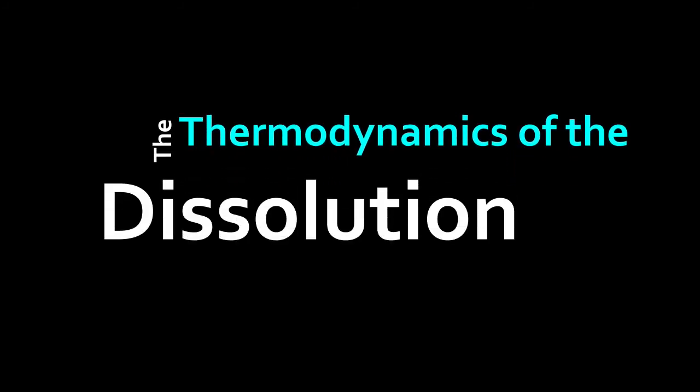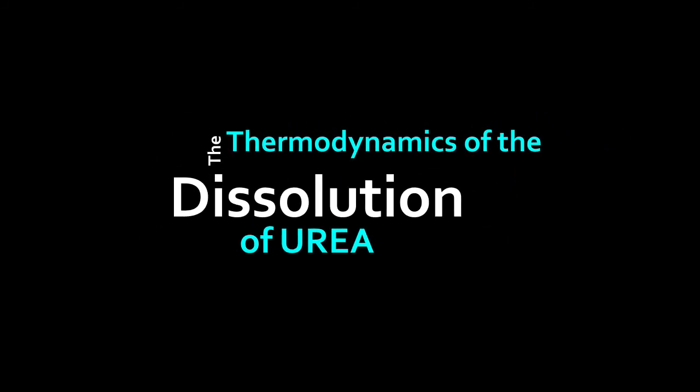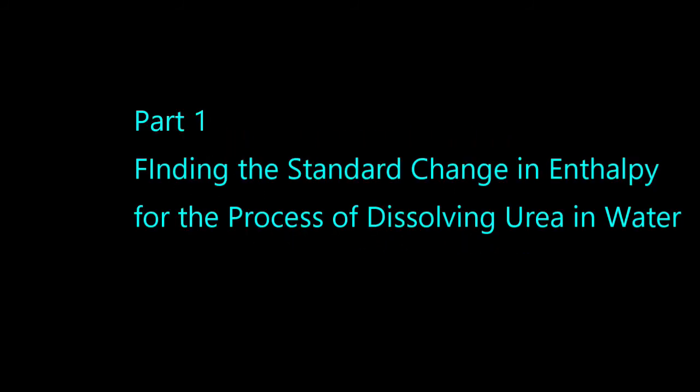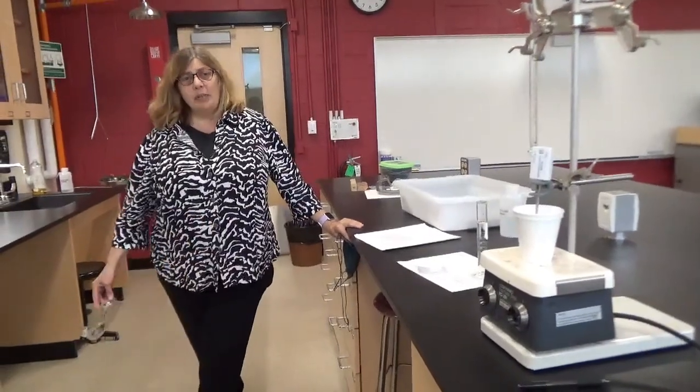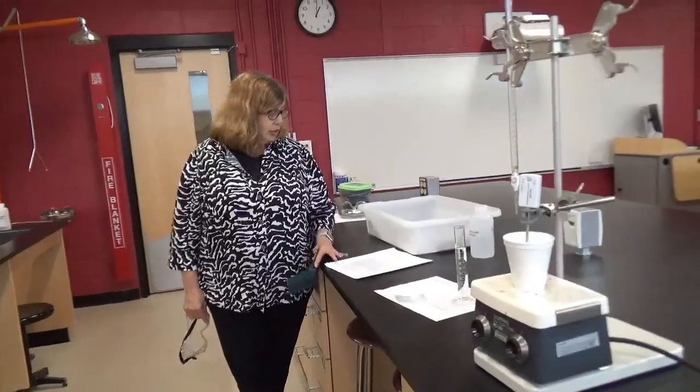This lab is on the thermodynamics of the dissolution of urea. In part 1, we find the standard change in enthalpy for the process of dissolving urea in water. Hi, today we're going to be doing a lab, and this is called the thermodynamics of the dissolution of urea.